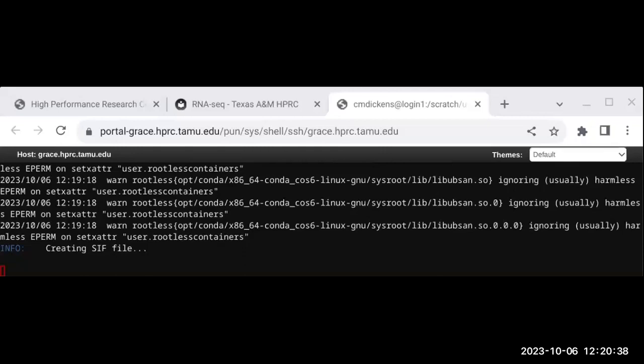You could actually do ls -l. You can do pwd to see what directory you're in. Basically, you're searching another, it's almost like another Linux file system. What's in that file system? What tools are there? Where are they located?